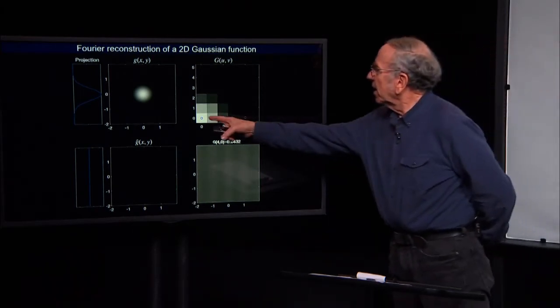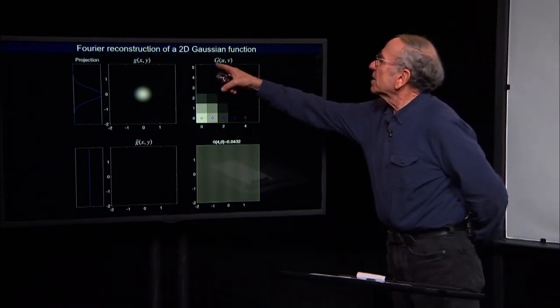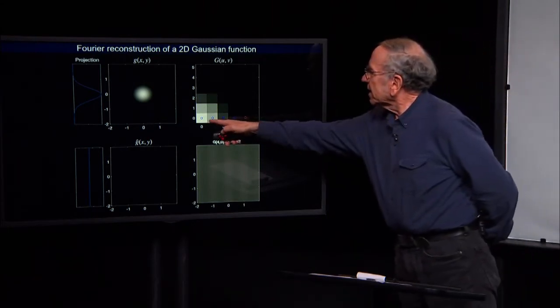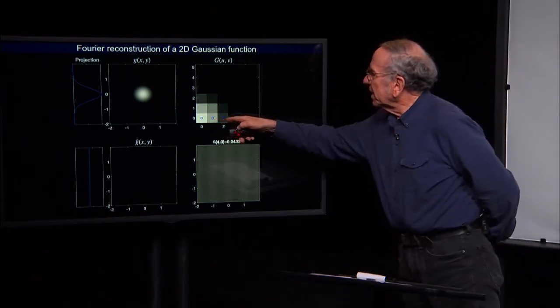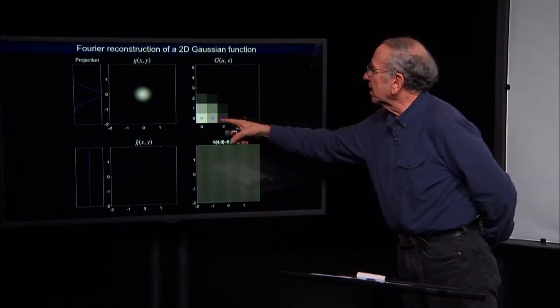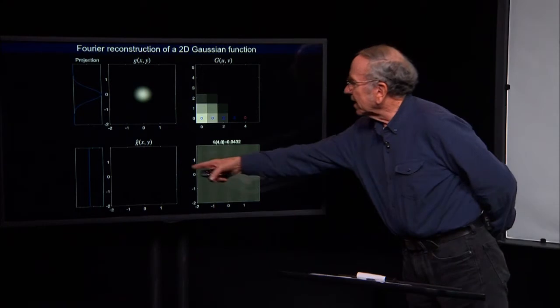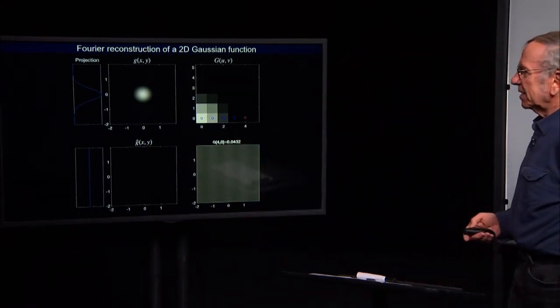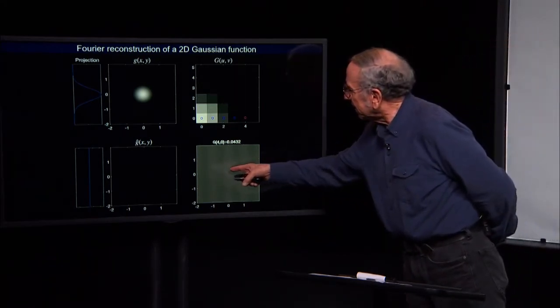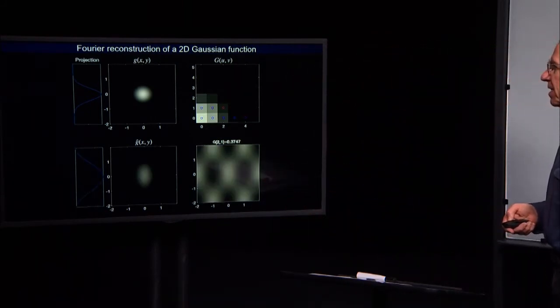So I have here a quadrant of what turns out to be the Fourier transform of my g function. And so as I plot these points, what I'm doing is taking a component, in this case with 2 cycles per the entire width, scaling it by an amount that is indicated by the gray level there, and adding it into my final function there. There's not a lot to be seen, but here you can see I have a cosine with 4 cycles running across.